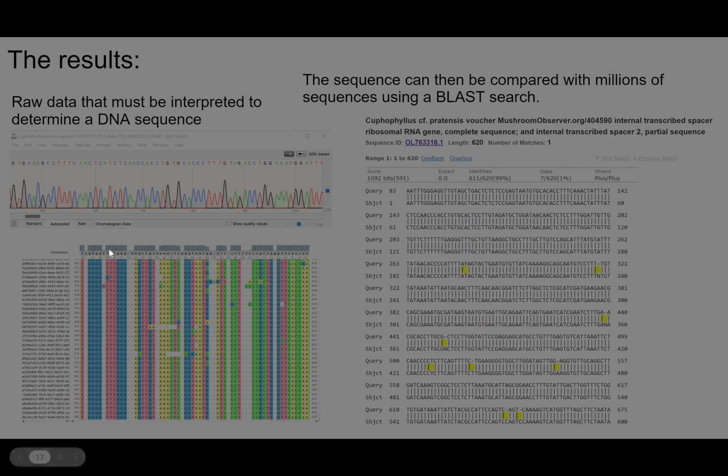And that's more or less what's actually happening with Sanger sequencing. It's not like a single DNA molecule comes through that capillary tube at a time. You're getting thousands, millions of DNA molecules of the same size traveling together through that gel. So this is also a consensus, because even within the DNA, there are errors.